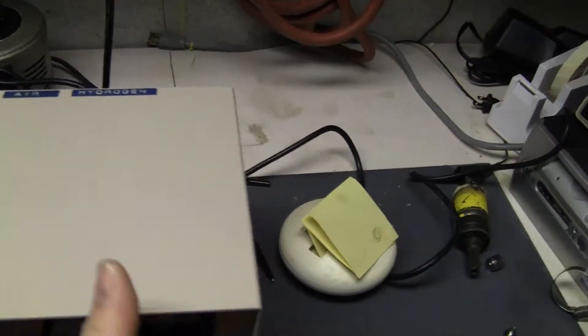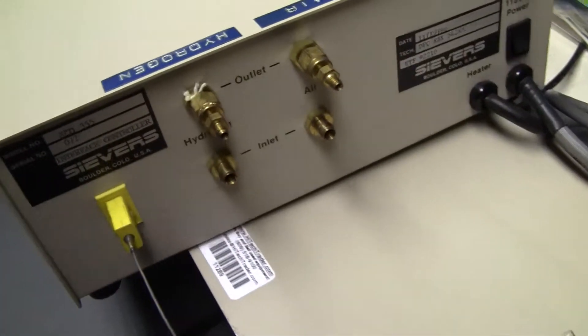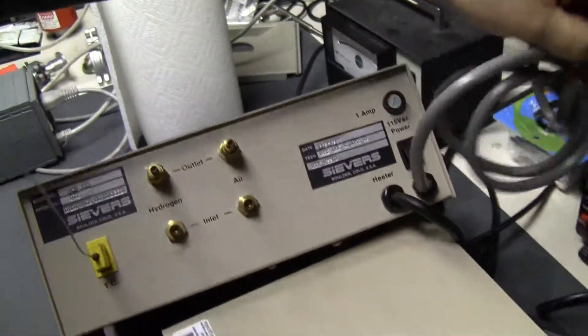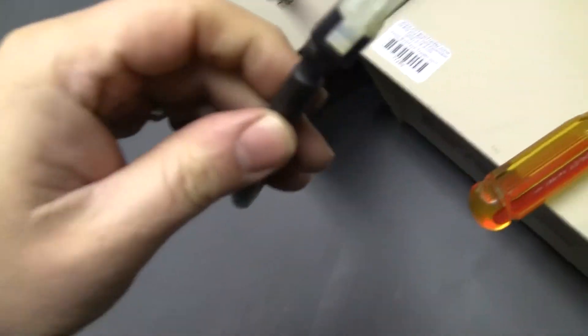Because there's no hydrogen or air on the back of it, let's turn it around. Nice fittings on the back, and the output plug is here.